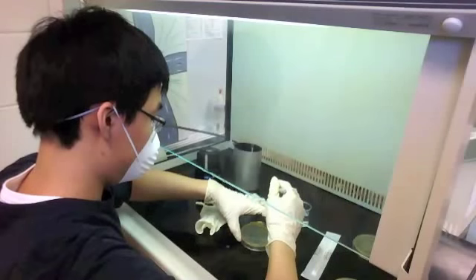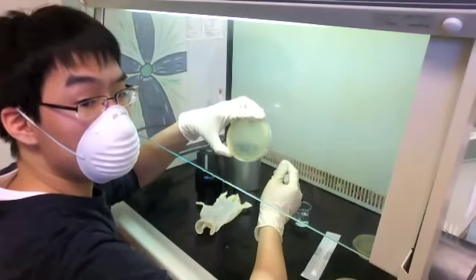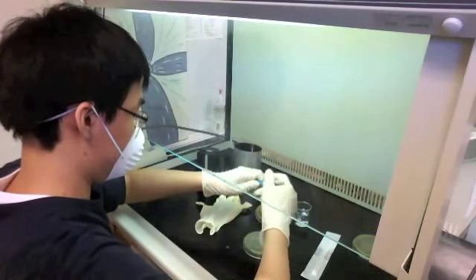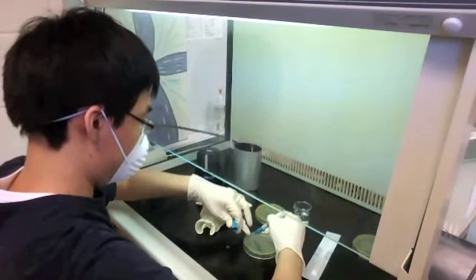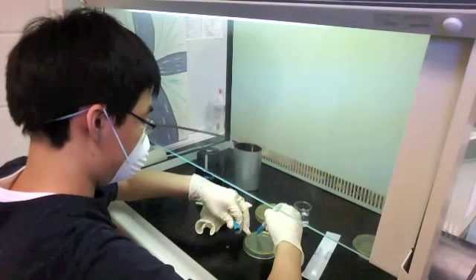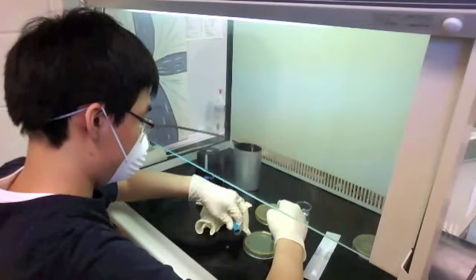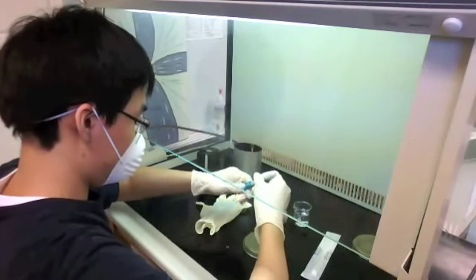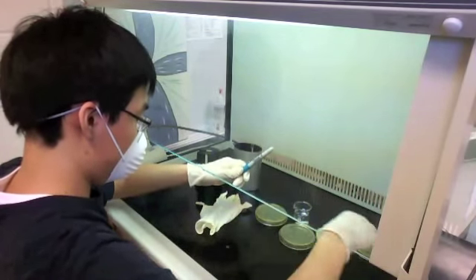I'm labeling them before, after, and water. I have 'before Violite' and 'after Violite' — that's the before plate, though you can't see it — as well as the water before and after, which I'll explain at the end. 'Before' and 'after' refer to before and after the UV cell phone sanitizer was used.